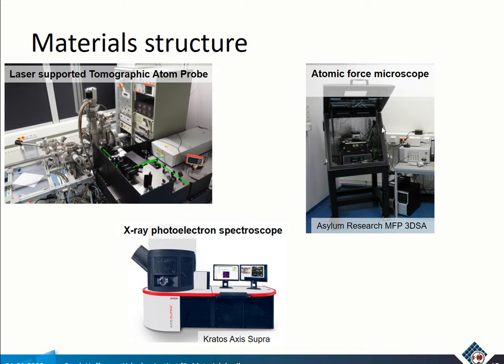The next thing here, we have an atomic force microscope from Asylum Research, with different kinds of tips, and quite fresh. We have here also an XPS system that was installed in the last year, if I'm correct. And this is then also opening up the path to the electron microscopes, but this will be the topic of the presentation of Tobias. Thank you for your attention.